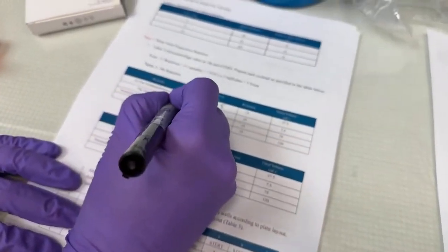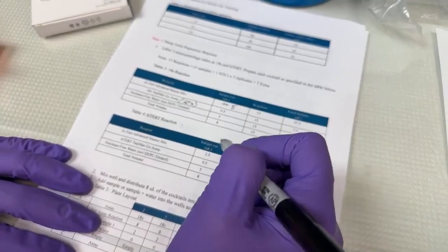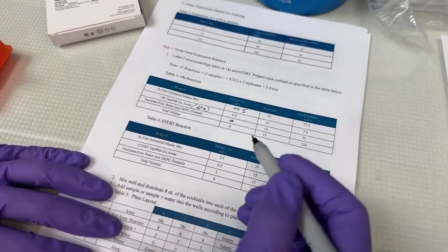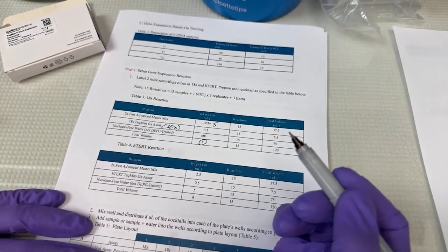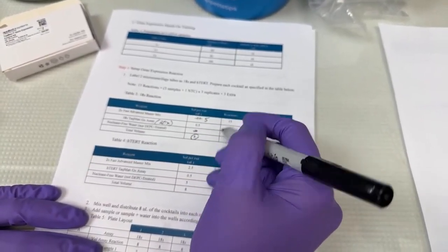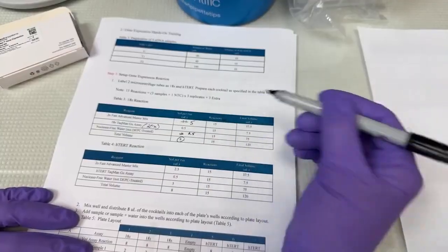This was originally at 20x for our assay composition, so there should be 0.5 microliters in each reaction. And then I have water that's going in. How much water? Good question. I'm going to add 2 microliters of my sample, which means I have 8 microliters for each one of my reactions. So I'm going to aliquot 8 microliters into my individual locations and then add sample to each of those, which means I have 2.5 microliters of water. I'm going to make 15 reactions total.